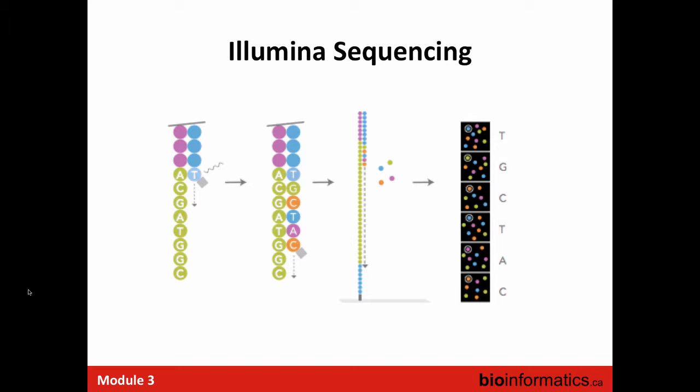Yeah, question? What does it mean when your sequencing provider tells you that the clusters were too close to each other and then the base quality deteriorates because of that? Yeah, so the base calling algorithm is trying to figure out what the sequence of colors was. If the clusters overlap, it will look like a mixed signal where it might look like it's both blue and green at the same time, and then it can't say for that part of the flow cell what the sequence was. Is that the issue with the DNA you're sending for sequencing, or is that just how it is?